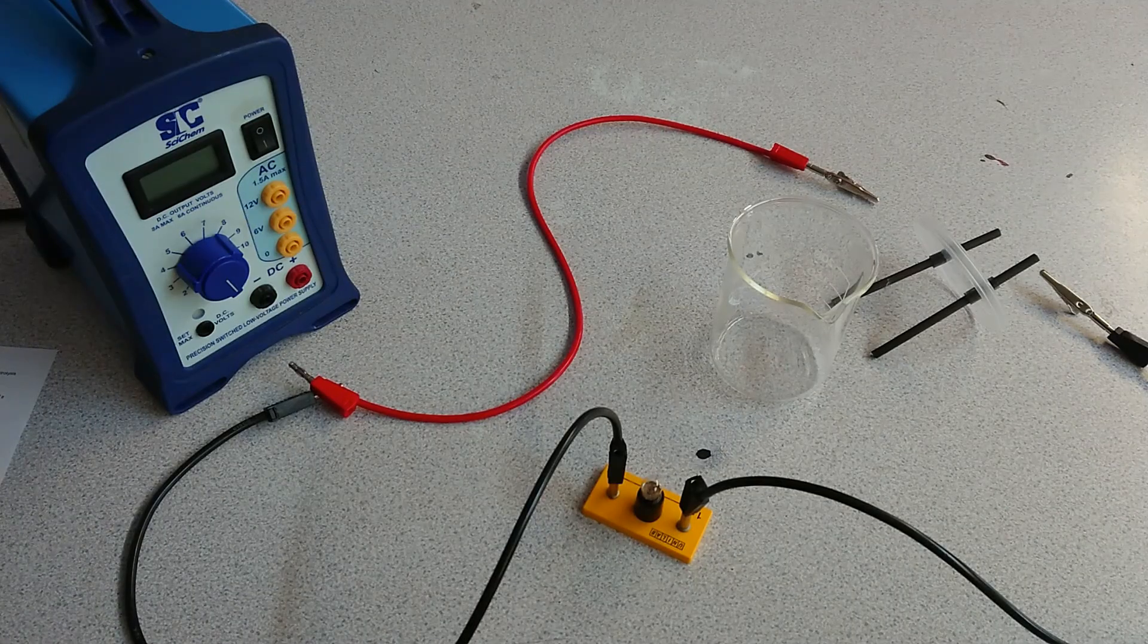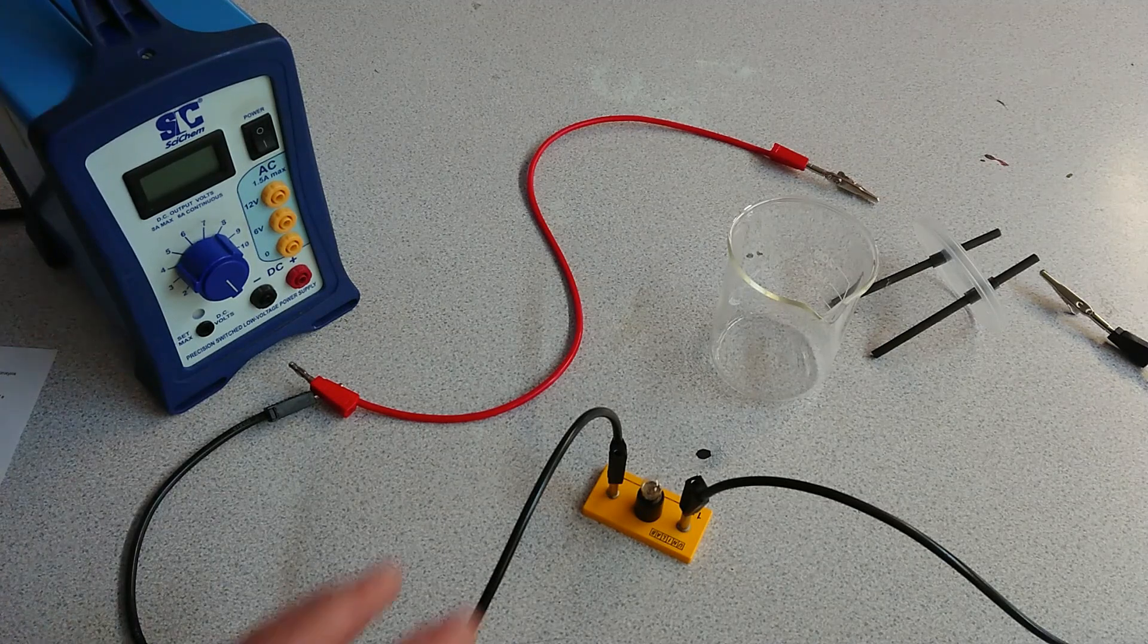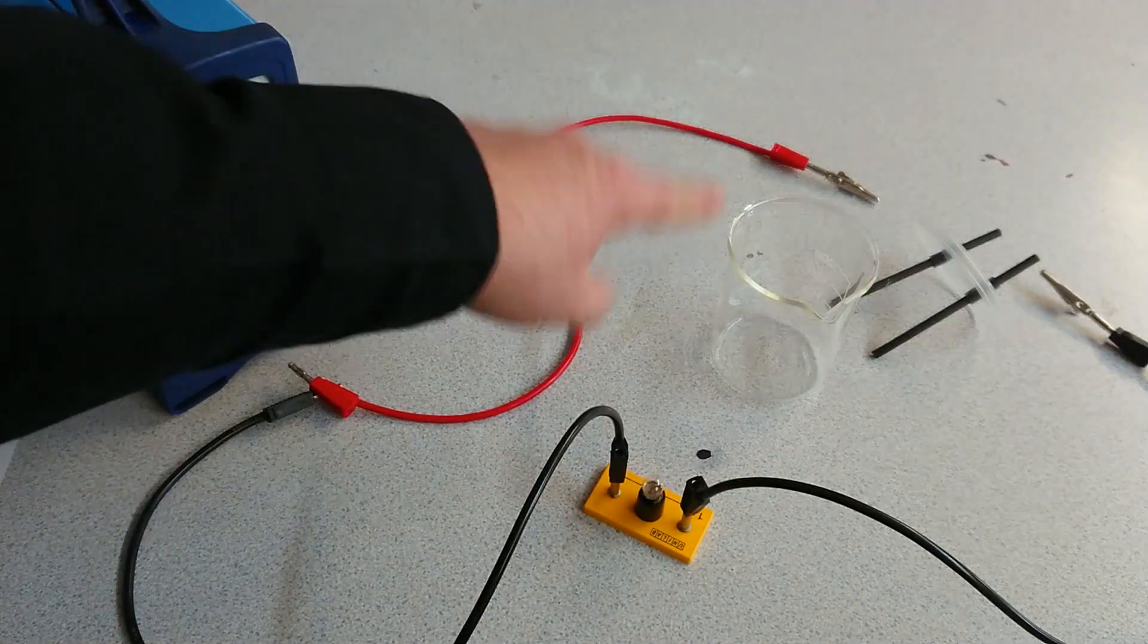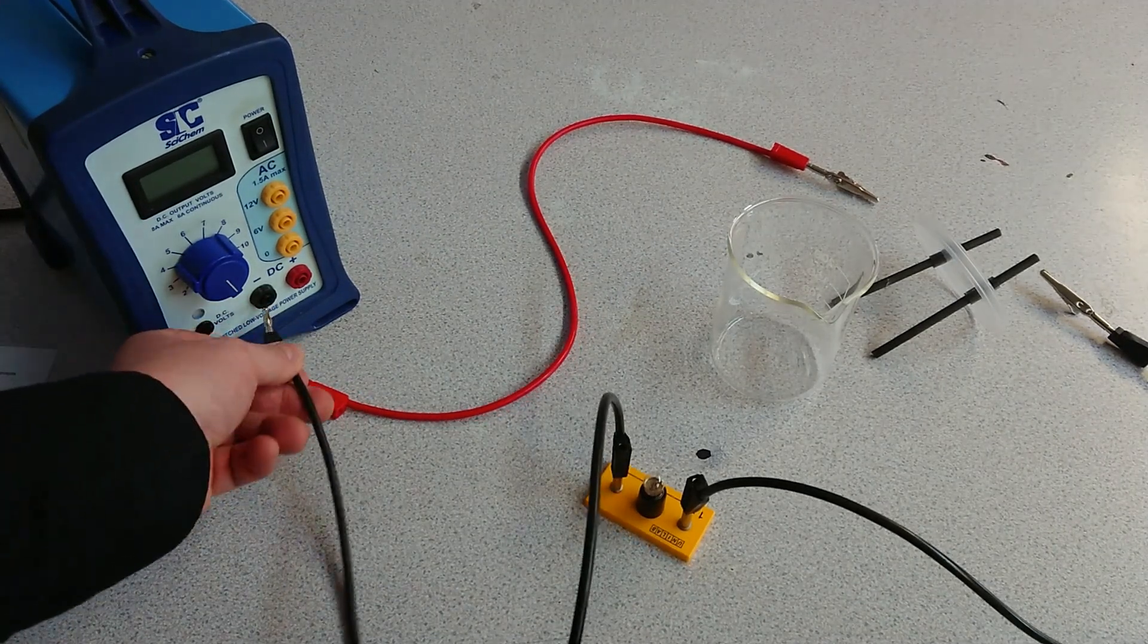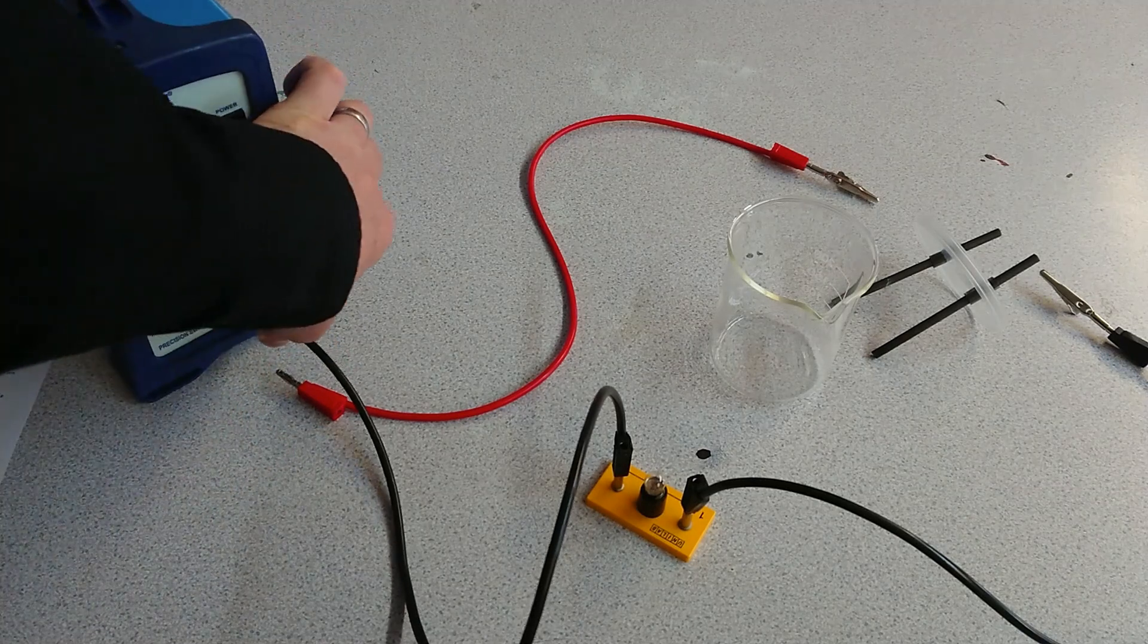Here's the equipment that we need: our power supply, our wires, our lamp, our electrodes, and our beaker. We're just going to connect up the circuit. Remember, always start at one side of the circuit. From our power supply we go to our lamp, from our lamp we come round to our electrode.